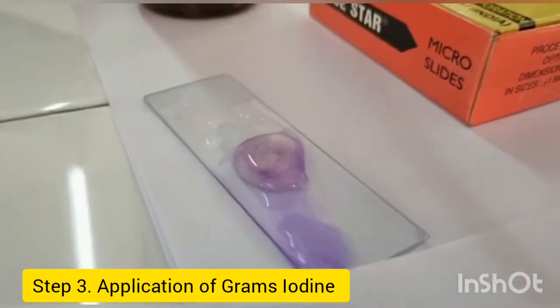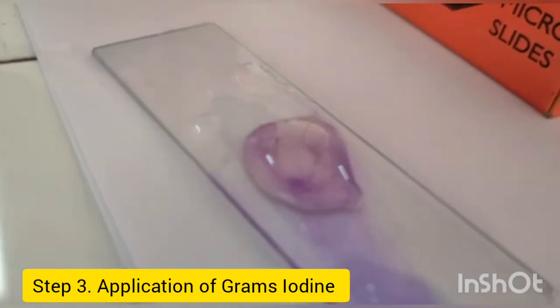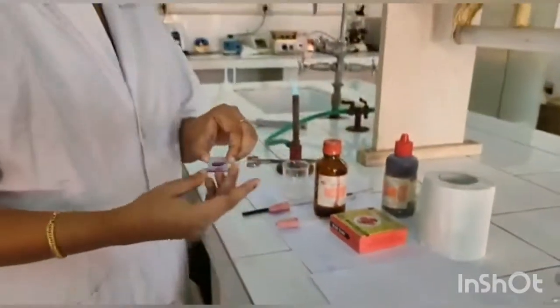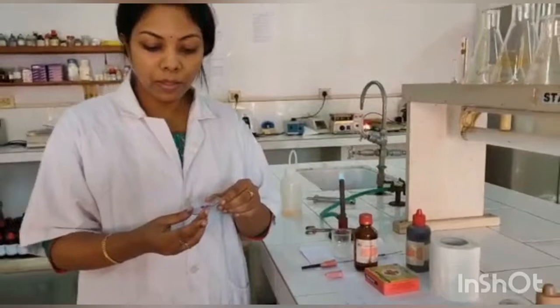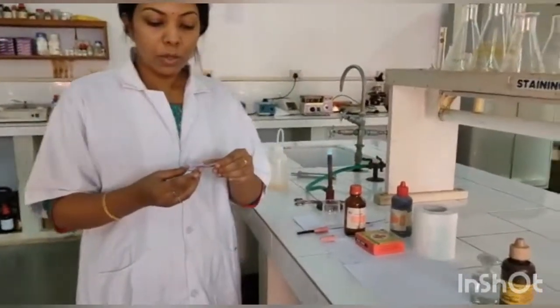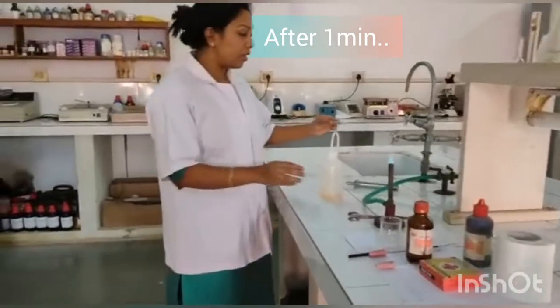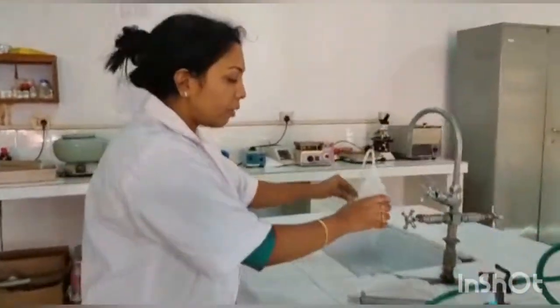We have to leave it for 1 minute as well. Cover the smear with iodine solution and wait for 1 minute. Now the 1 minute is over. We'll wash it off with the same water again.